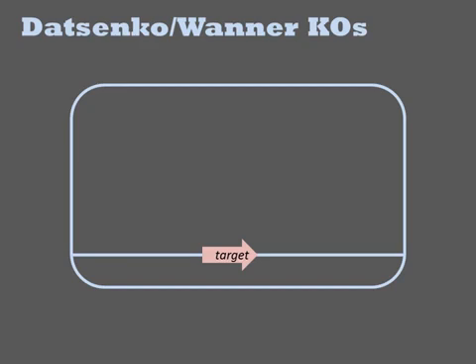A very popular setup for homologous recombination in E. coli and other prokaryotes is the Datsenko-Wanner method. It is a lambda-red based method for knocking out genes in the genome. It begins with pretty much any E. coli strain containing the target sequence we wish to remove.